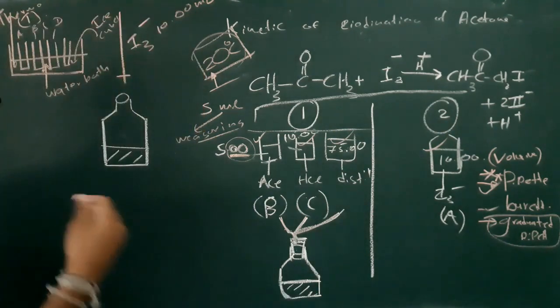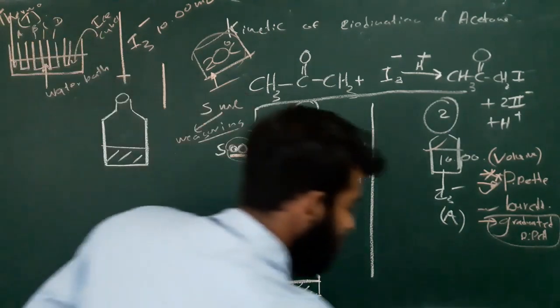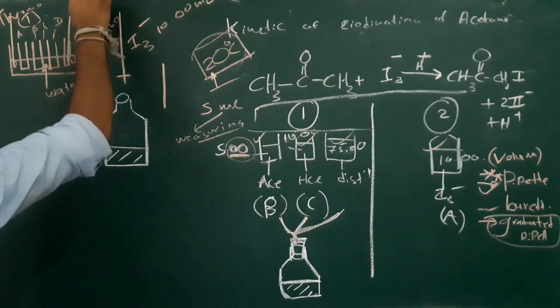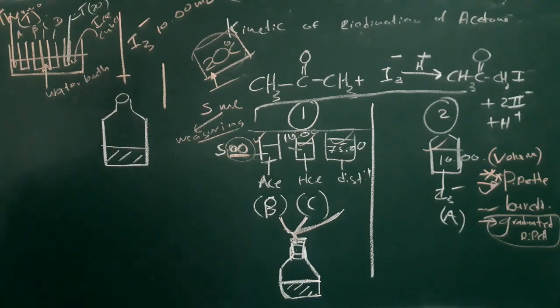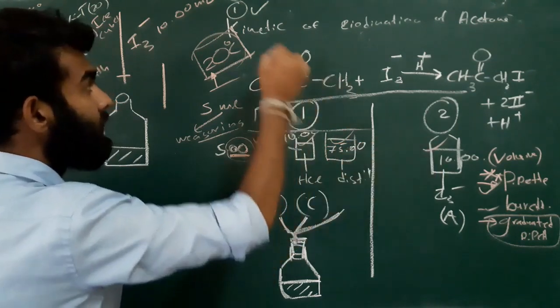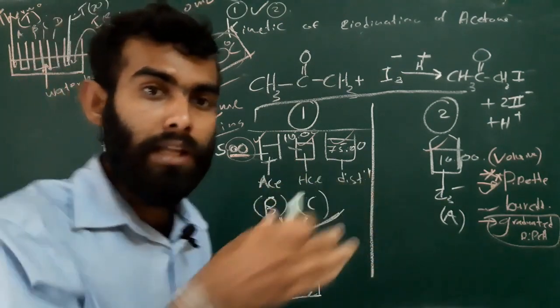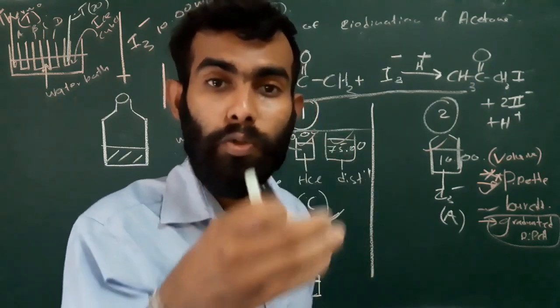So we have to use separate thermometers, and we will add thermometers into these solutions separately, and we will check the temperature whether it is 20 degrees or not. Okay, so first thing we have to maintain the temperature, and we will keep our reactants in that water bath, and we have to check the temperature. So we have to stir well. We have to mix the water bath as well as the solutions also.